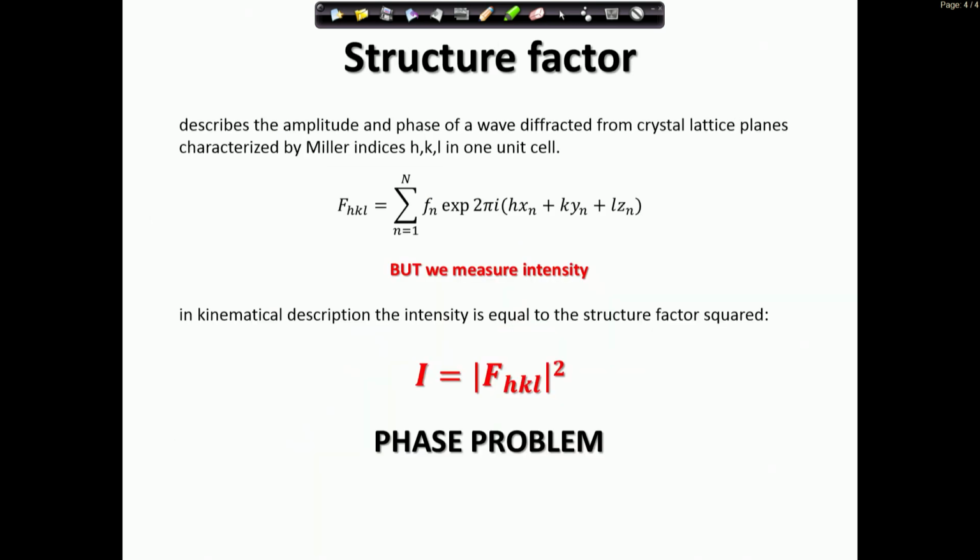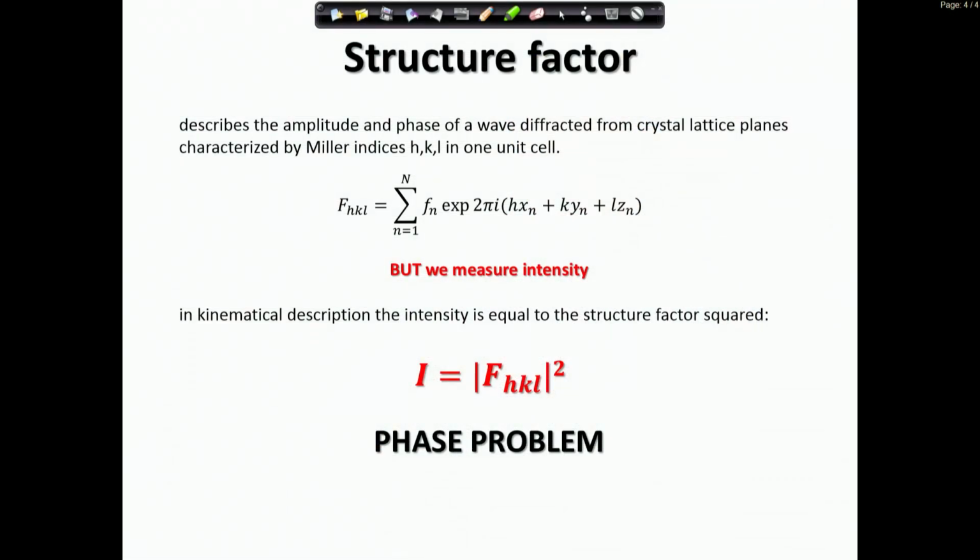All right. So that was the geometry. So far, we considered mostly the geometry of the crystal structure, be it the symmetry or the diffraction. We considered only the positions of the spots, and we did not really speak much about the contents of the unit cell, about the structure. And that we will do now. And we'll start with the concept of structure factor, which is a way to describe the amplitude and the phase of the wave diffracted from a crystal.